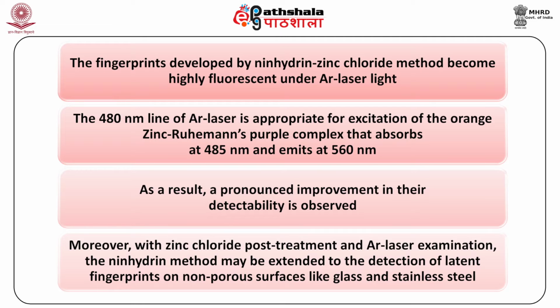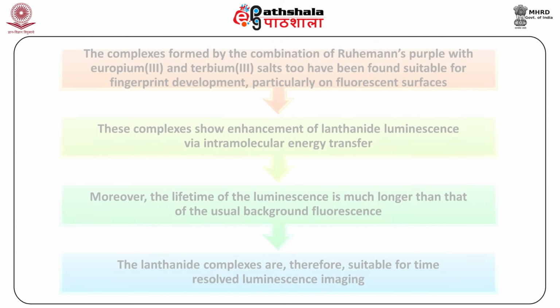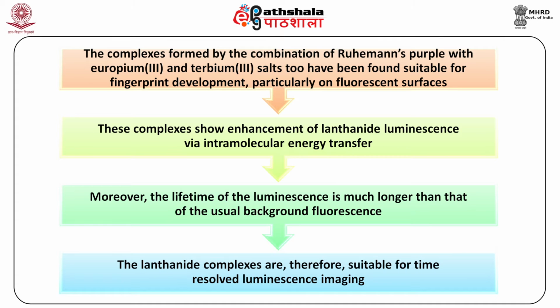Moreover, with zinc chloride post-treatment and argon laser examination, the ninhydrin method may be extended to the detection of latent fingerprints on non-porous surfaces like glass and stainless steel. The complexes formed by the combination of Ruhemann's purple with europium and terbium salts too have been found suitable for fingerprint development, particularly on fluorescent surfaces.